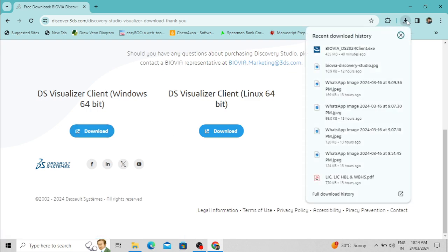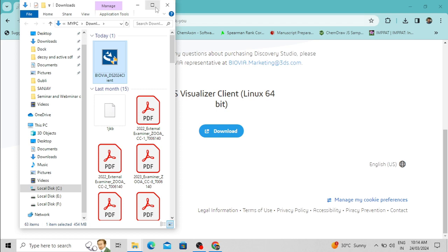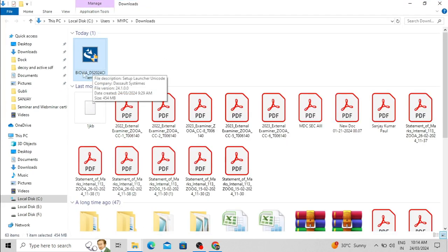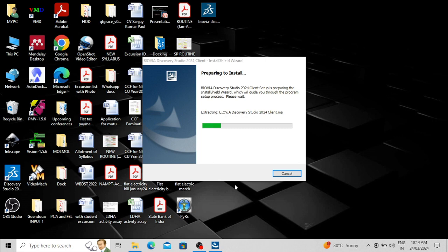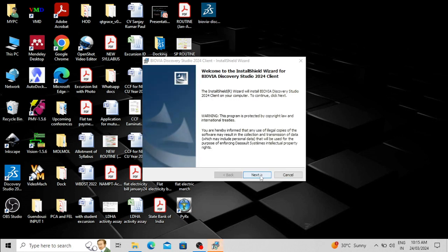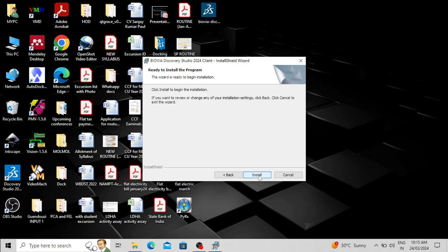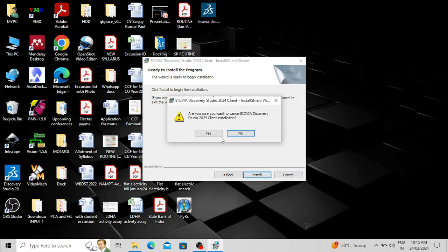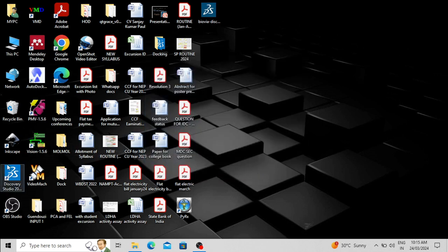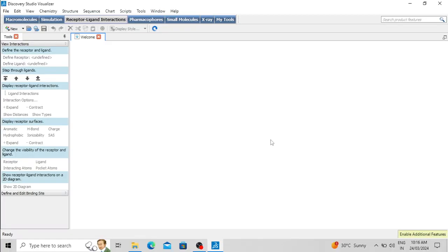I have already downloaded the software and it is present in my downloads folder. This is the setup file — double click here to install the software, then click Next, Next, and Install. After installing, a desktop icon will appear. Double click it to open BIOVIA Discovery Studio. It's now open and this is the interface of BIOVIA Discovery Studio Visualizer.